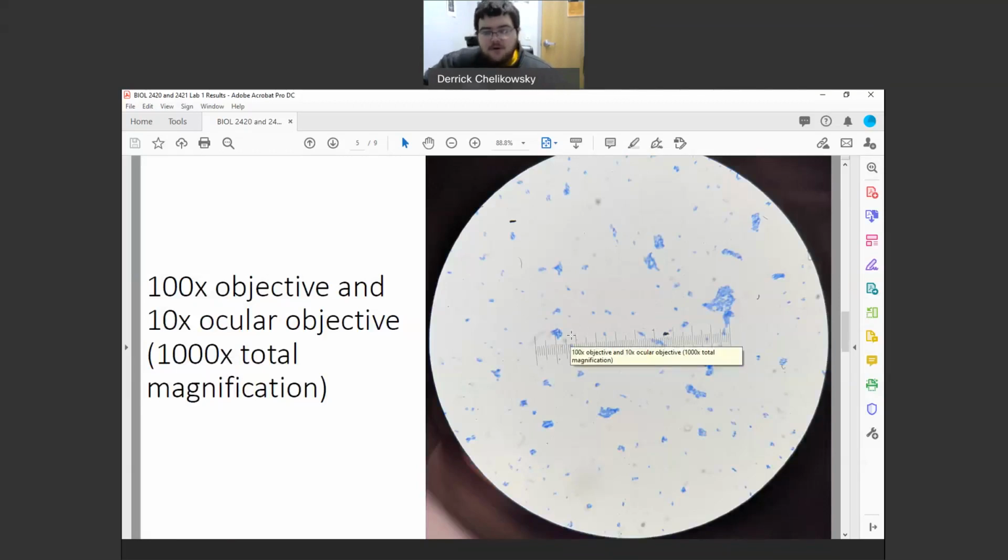On some of your worksheets, not for this week, but certainly for next week and the following weeks going forward, you will need to provide measurements. If we don't provide a micrometer, you can't measure. So only measure on things that you have the micrometer. Almost all of your pictures that you're requested to draw are going to be using a micrometer because you want to measure on every single picture.